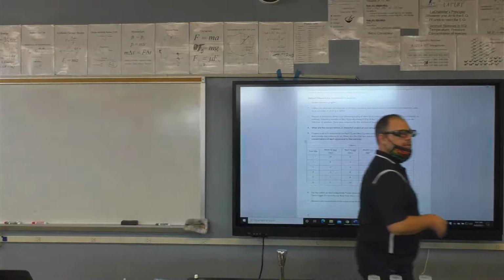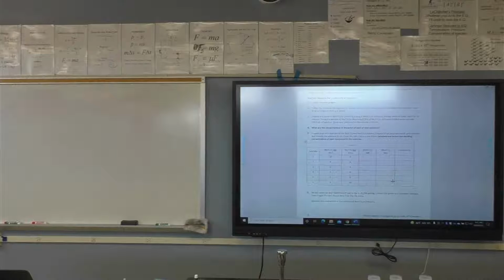All right, so our conductivity meters are back here. They are pretty simple. They do need to plug in. So the conductivity meters are right here. So there's a meter, there's a little sensor. The instructions say it's 20,000, it's right there. They do need to plug in to LabQuests. So these are LabQuests. Turn them on, and then they plug in, depending on whether it's analog or digital. They plug in right here, and then the conductivity is given to us in micro something per centimeter. I don't remember what that's called, but anyway, so there you go.